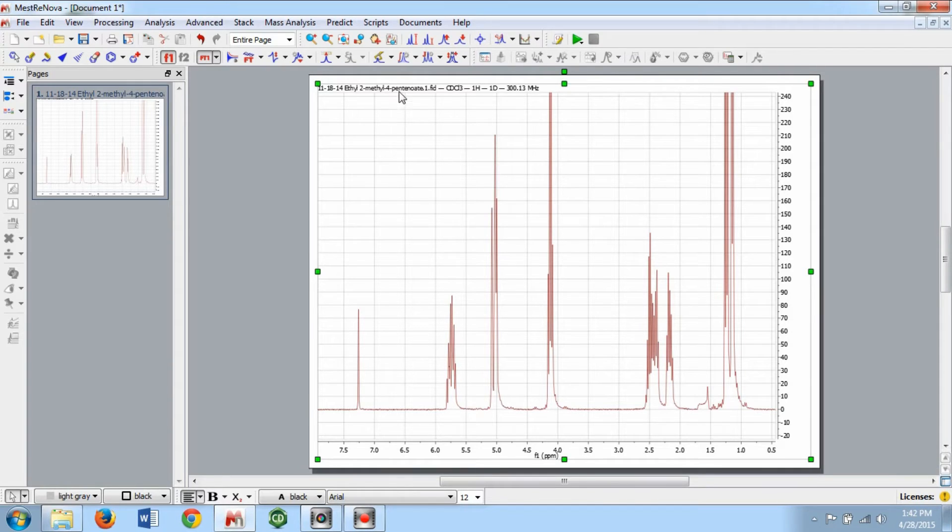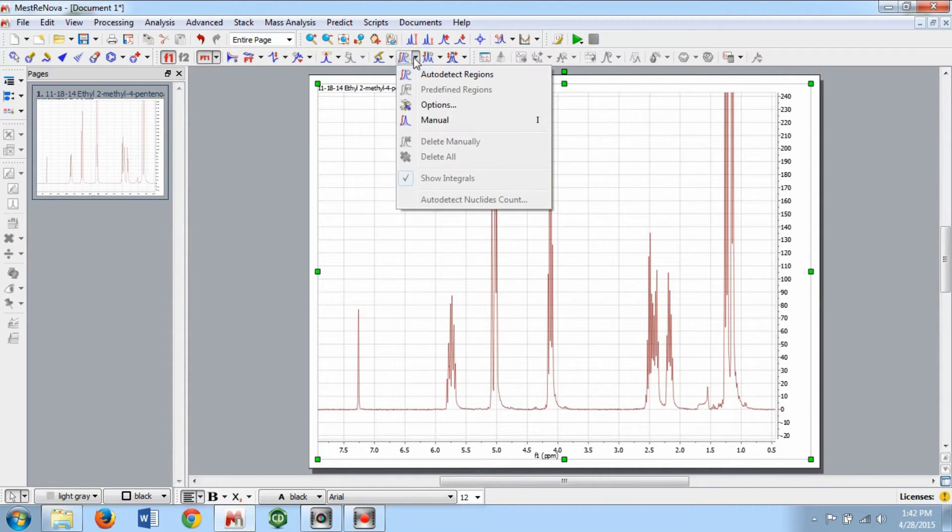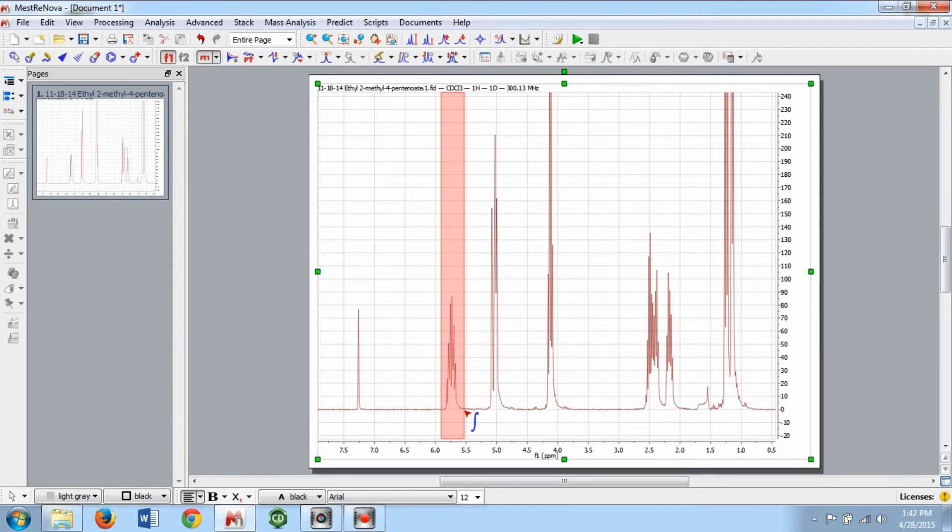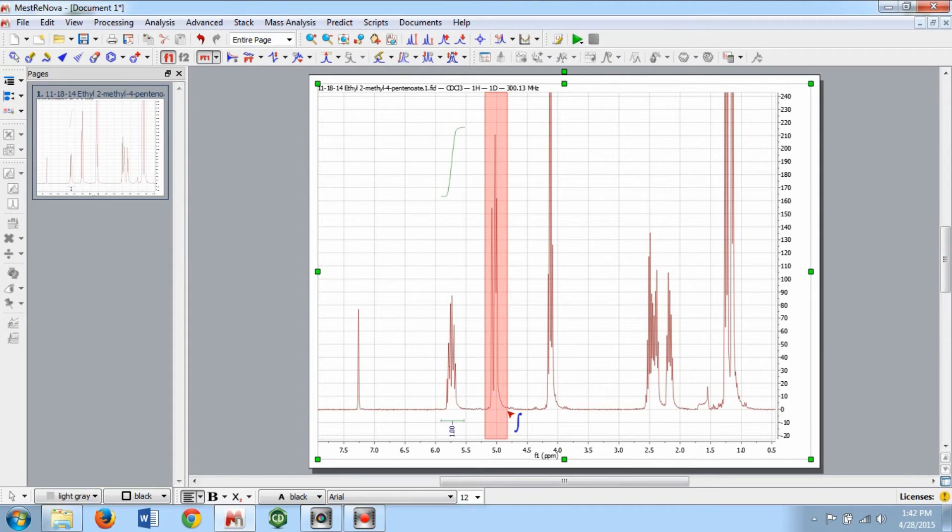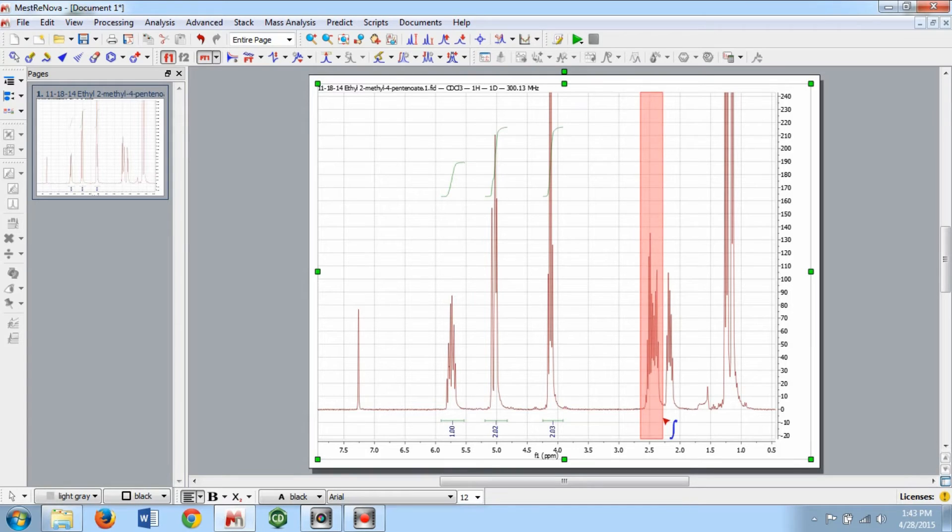Next, we'll integrate our peaks. The simplest way to integrate is to use the Manual Integration feature. Click on the arrow next to the Integration button and select Manual. Alternatively, you can press I on your keyboard. You want to select the whole peak plus some on each side without selecting adjacent peaks.